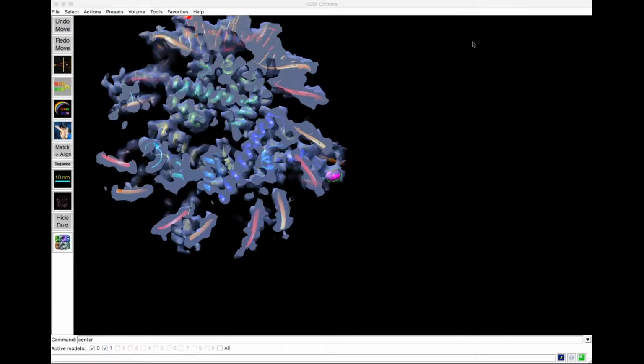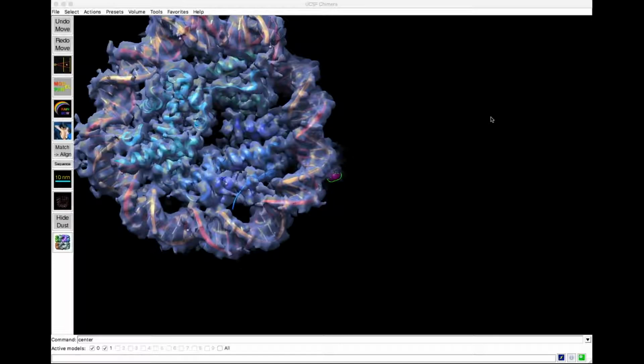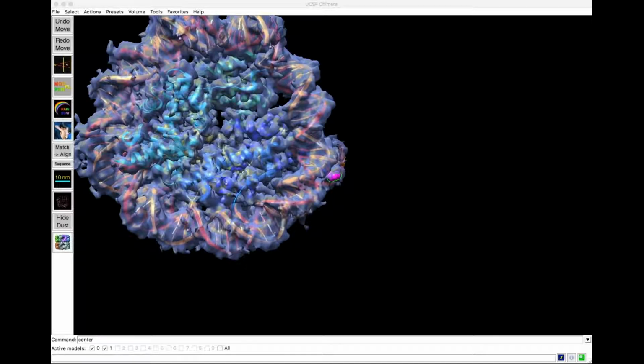It's all in the same menu. This pops up a look at how we're viewing the structure. This is our camera with this little yellow box being our viewpoint, and then the physical slice that we're looking at down here. You can click and drag these yellow lines to include the whole structure, and that might be easier for you to view.